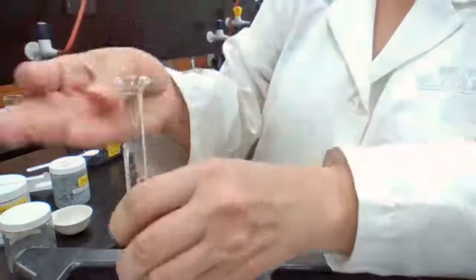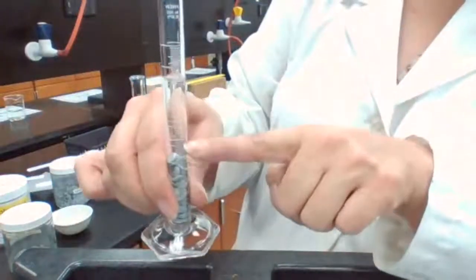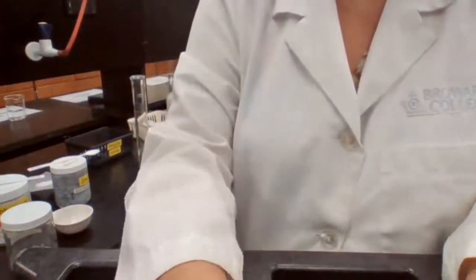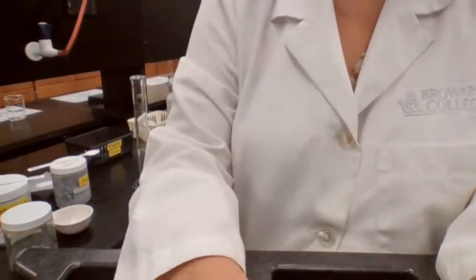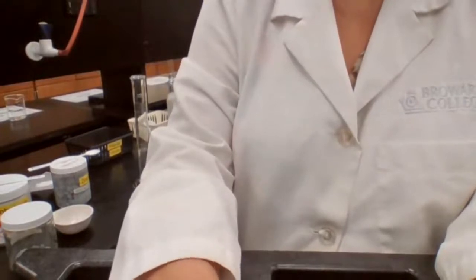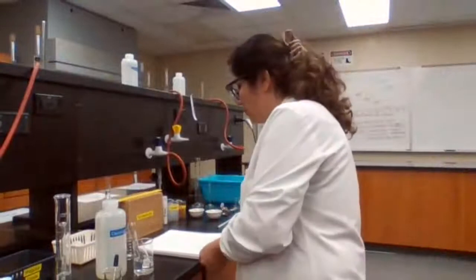The volume now goes up. So this method is called measuring volume by displacement. When I add the zinc, it displaces the water. Water goes up. I read the number again. 8.35 is the volume after adding zinc. They can find the volume of the zinc. That's for 20 pieces. If you divide by 20, you get the volume for 1.